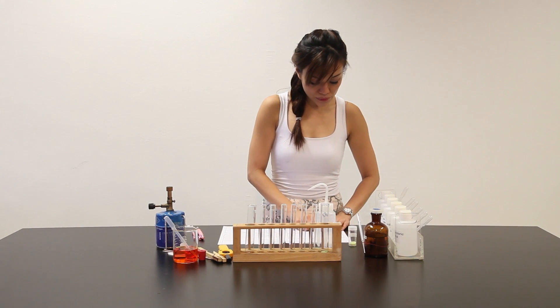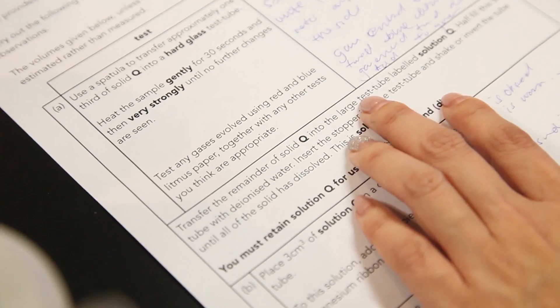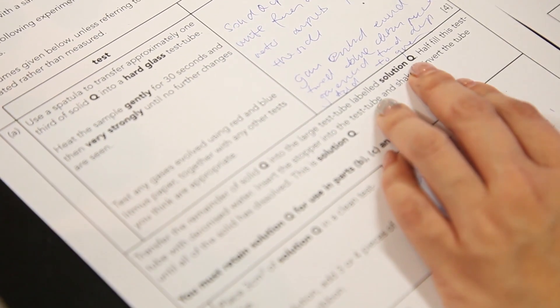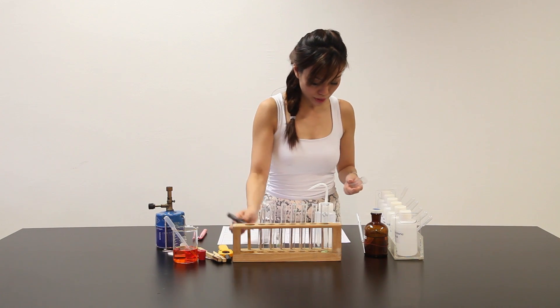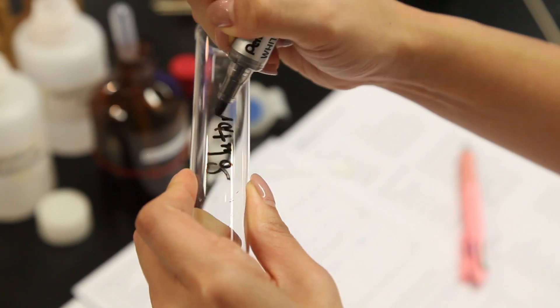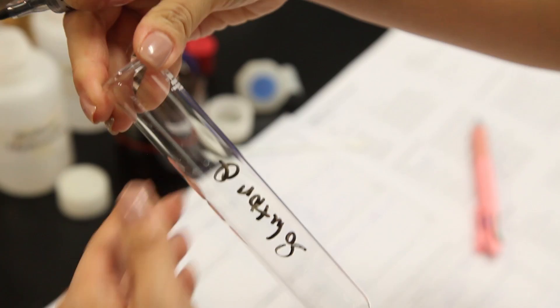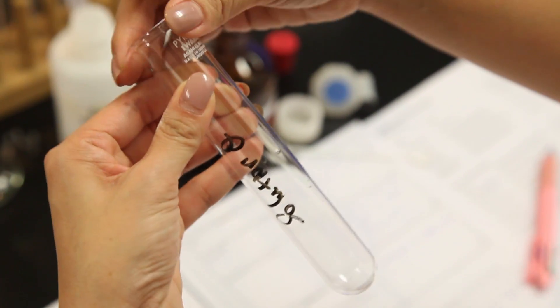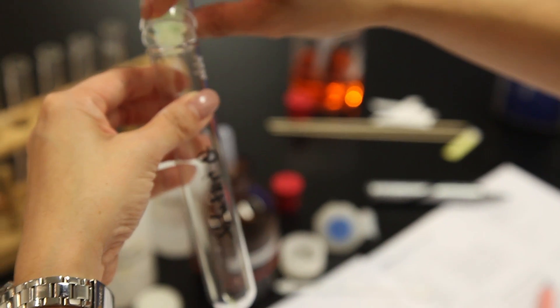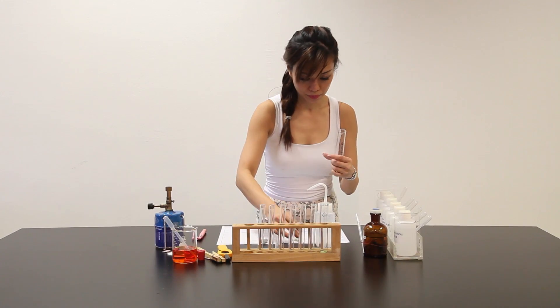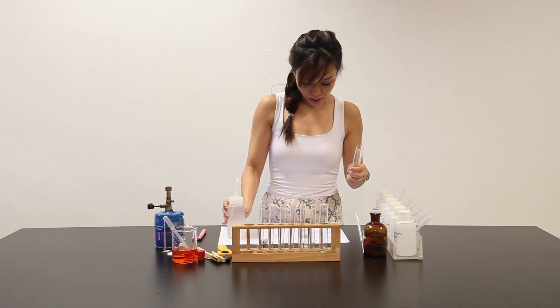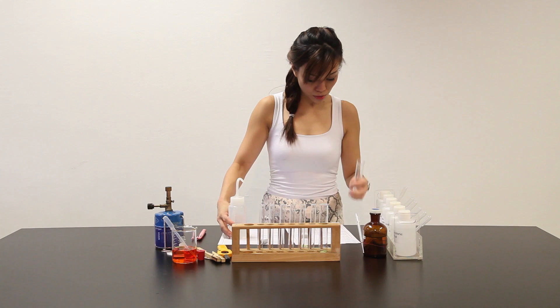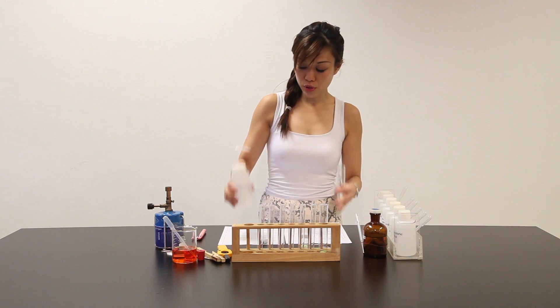And then it goes on to say that transfer the remainder of SORT-Q into a large test tube labeled solution Q. So I have some more of it over here. I'm going to label it as solution Q. Transfer the rest of SORT-Q into this large test tube and I'm supposed to fill this test tube with deionized water which is over here.